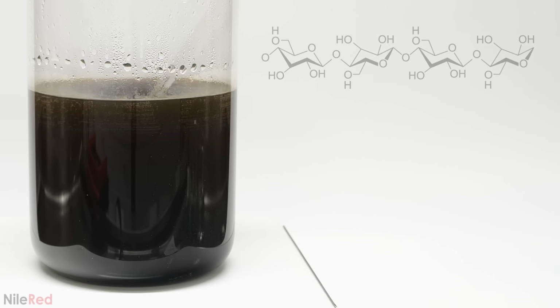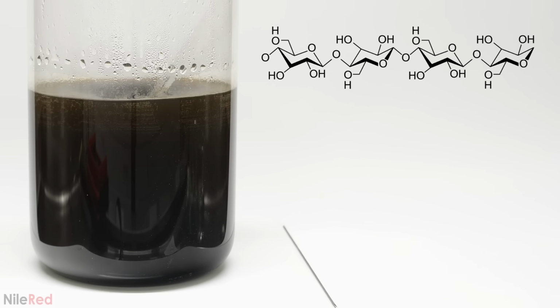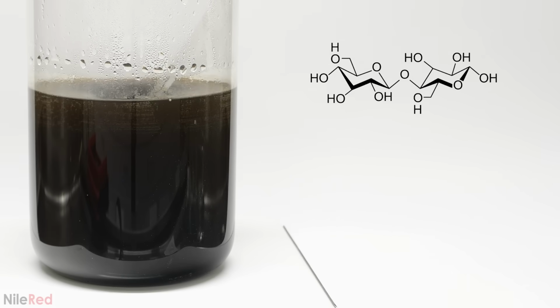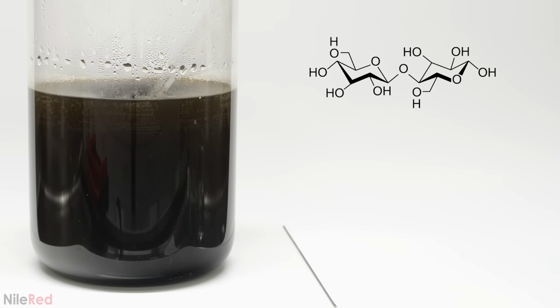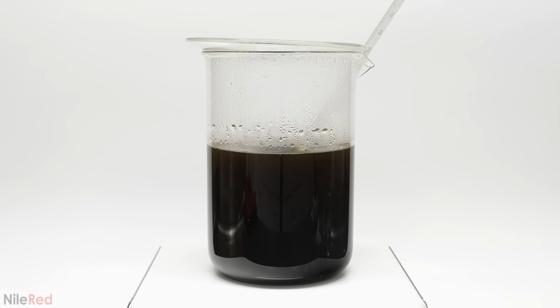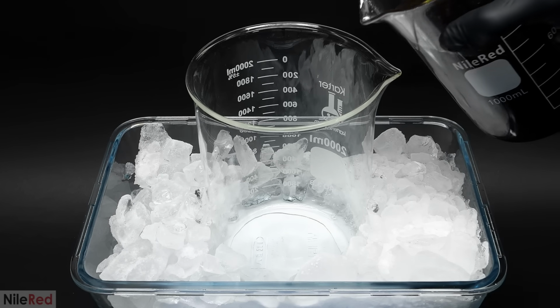The long cellulose fibers were being attacked by the acid and water, and they were breaking the bonds between the sugar units. This type of reaction is called a hydrolysis reaction, and they were breaking it down into smaller and smaller pieces. I had to keep it running like this for 2 hours, and in that time, it should fully break down into glucose.